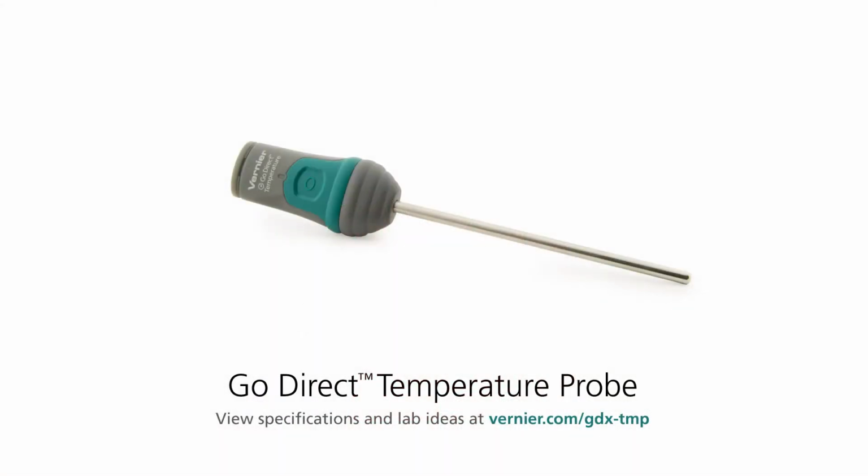Today we will be investigating evaporation and intermolecular attractions with two of our GoDirect temperature probes. In this experiment, temperature probes are placed in various liquids. Evaporation occurs when the probe is removed from the liquid's container. This evaporation is an endothermic process that results in a temperature decrease.